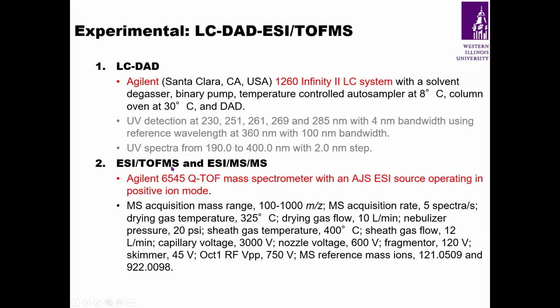And the ESI TOF-MS and the ESI MS-MS use an Agilent 6545 Q-TOF mass spectrometer with an Agilent Jet Stream ESI source operating in positive ion mode.